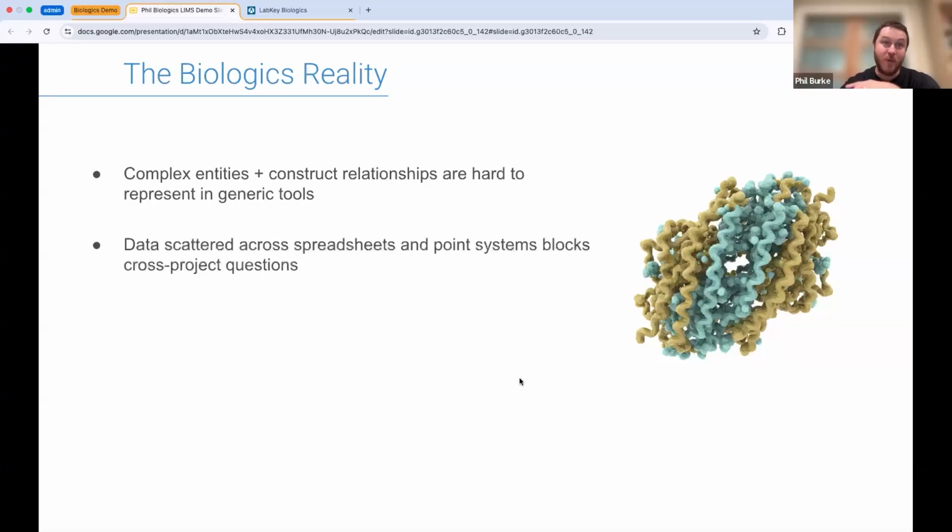And this can lead directly to the next problem, which is data being scattered across different locations within your system. When you finally find the data that you need, it's then difficult to share it with team members as well. Another thing people run into is that manual handoffs really can increase errors and slow down decisions. Not being able to grant people access who need access to see the experiments and results that you've been doing can definitely cause problems. You want to be able to quickly identify what's viable, and when you can't, this can really slow things down quite a bit.